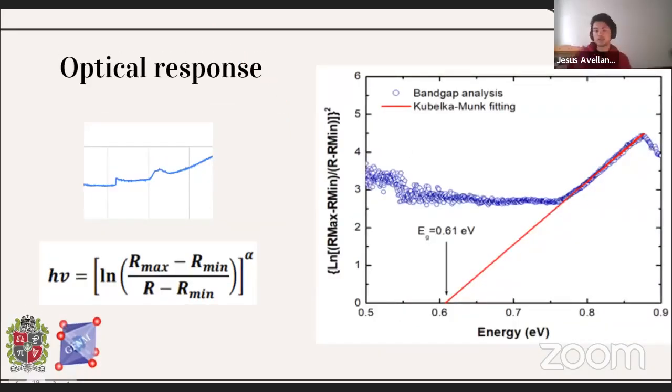Okay, so speaking a little about the results obtained by the optical responses, initially we took the usual absorbance and reflectance measurements, and the data obtained were the basis of the results that we are going to discuss. Initially, what caught our attention was that, as you can see right here, there are peaks in the graphs that should not be initially observed. So with the help of Professor Ra and some literature, we found out that it is possible to associate bond vibration energy with each of the peaks.